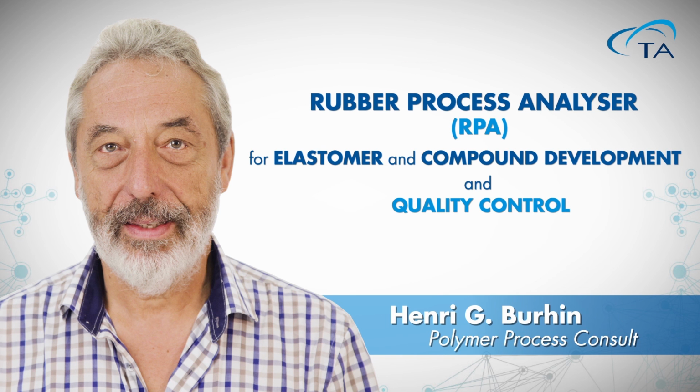Using the LAOS technique, or maybe if not, you can give some insight as to how you understand natural rubber to filler interaction with the RPA in general. Well, if you want to really study filler-polymer interaction with whatever polymer, it could be natural rubber, SBR, BR, or whatever, of course what is really important is to consider a Payne diagram, which is a strain sweep.